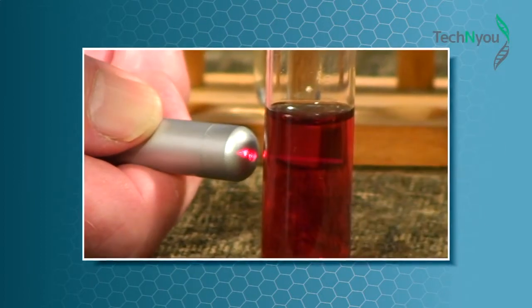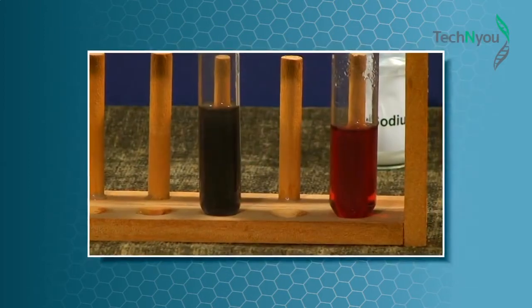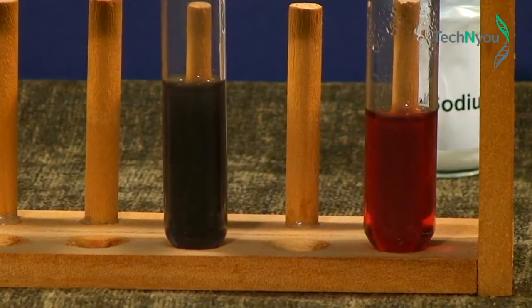That concludes our experiment. We have shown how to produce gold nanoparticles, how to confirm their presence, and how to exploit some of their behaviours.